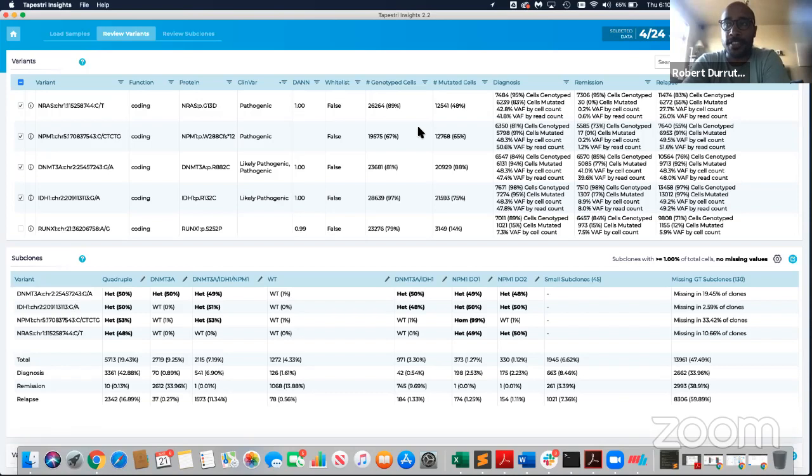We are in the process of publishing a rather comprehensive document that can be used as a working guide. The timeline for that is about 1 to 2 weeks. It'll give exactly the information that I just walked through, with additional recommendations that were not part of today's discussion.